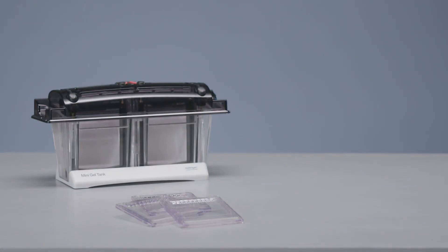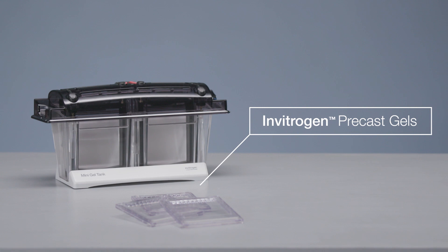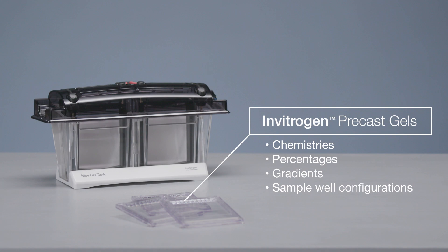Thermo Fisher Scientific offers a wide variety of Invitrogen precast gels in different chemistries, percentages, gradients, and sample well configurations. Make sure you choose the right protein gel based on the size of your protein and your downstream applications.